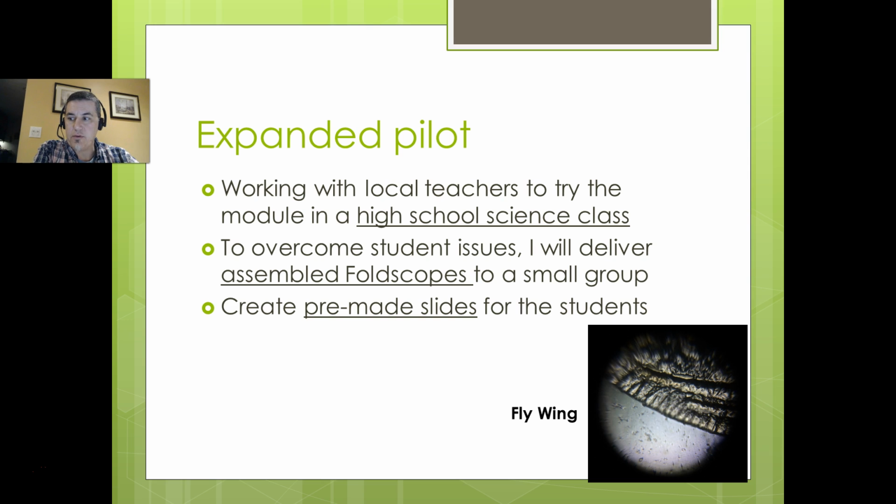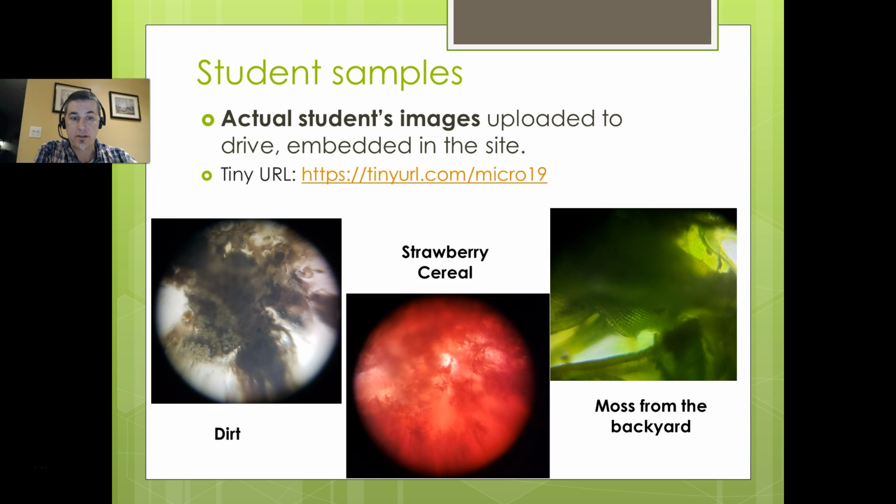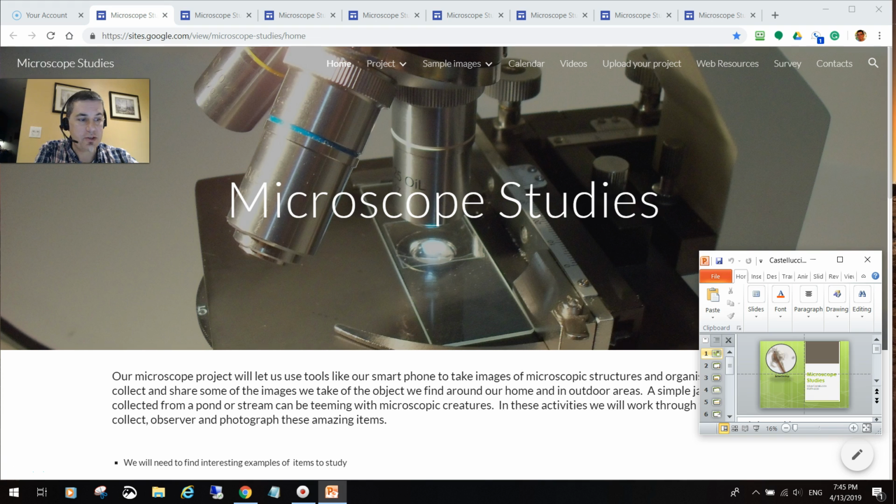Expanded pilots over the summer and maybe into the fall. Even if it's just on my own, I want to see how this works with students as it's presented in a course. So if the students had to actually deliver final images, if they were put in groups or if they're put in individual studies, how would they behave? How would they react to this stuff? And like I said, the student came back with some interesting stuff: dirt, moss, and you can see some actual structure in the moss. And my favorite was strawberry cereal. Who knew? Let's look at some strawberry cereal.